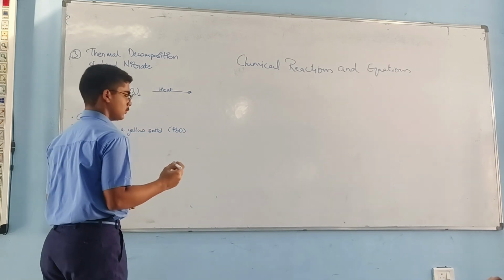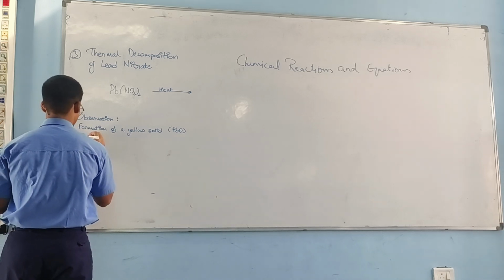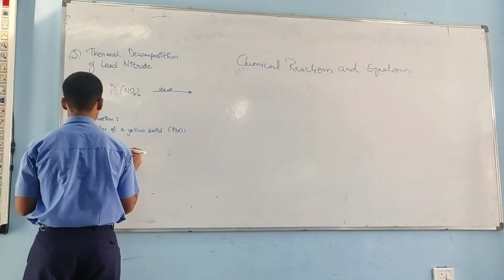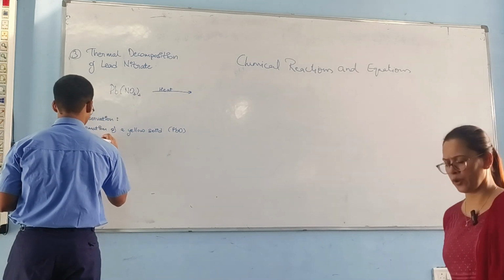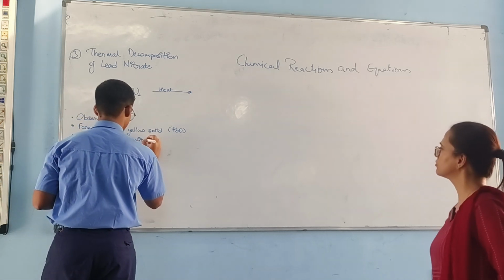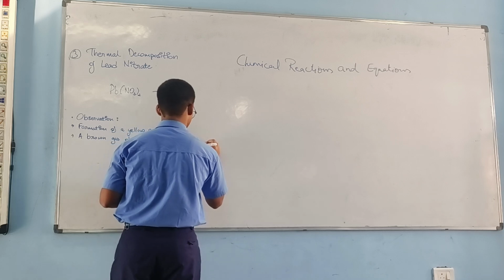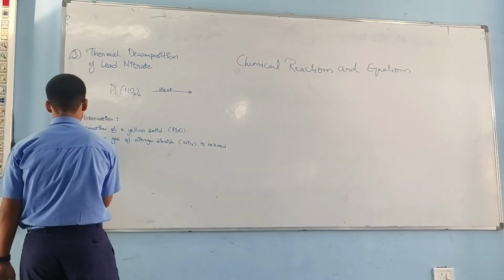ठीक है? And apart from that, a release of brown gas is there. A brown gas of nitrogen dioxide is released. Nitrogen dioxide is NO2. And number 3, oxygen is also released.